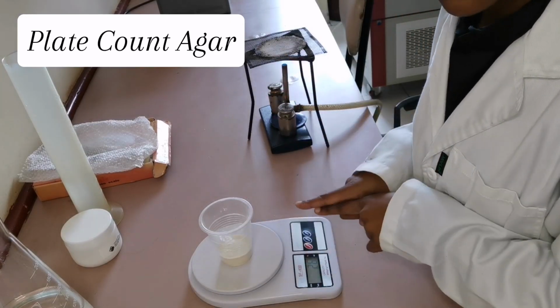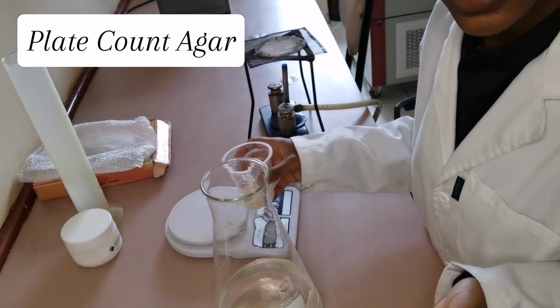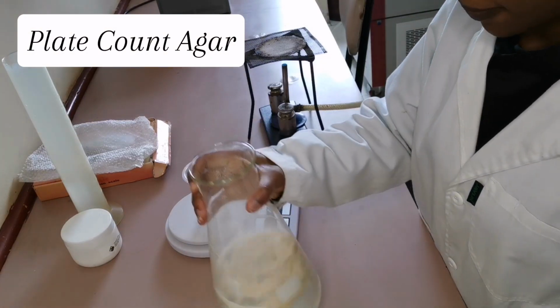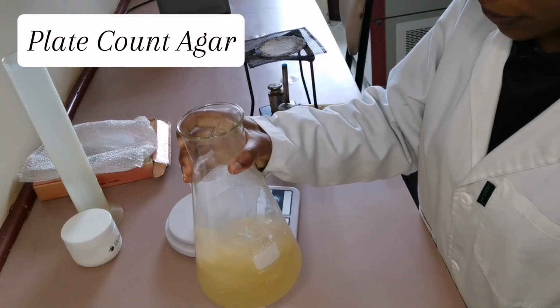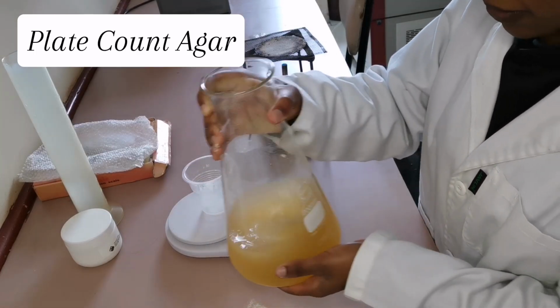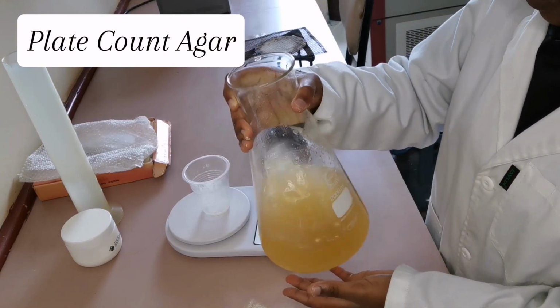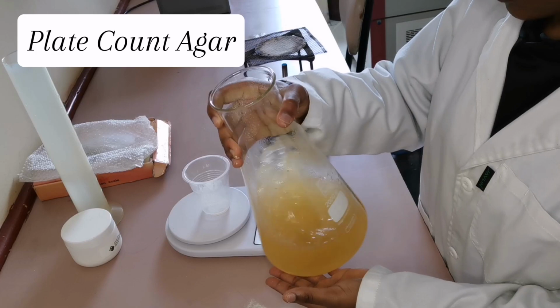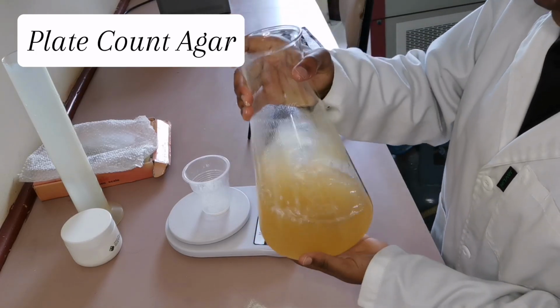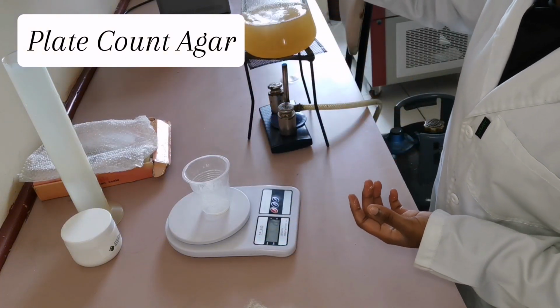Now let's mix this powder with this 1 liter of distilled water. Give it a good stir, like so. Just a good stir. Once it's done, we have to boil it until it's completely dissolved on this Bunsen burner, like so.